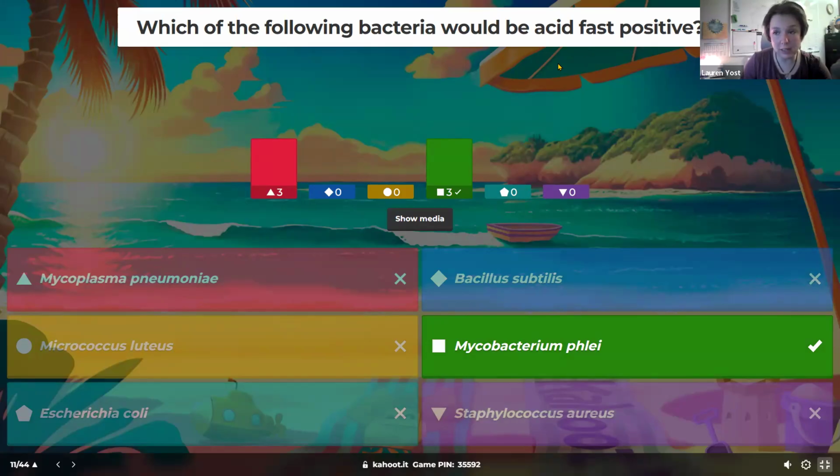If it's acid-fast positive, then we already know from our little cheat sheet notes that it would be pink, that fuchsia color. And why is it staining with our primary stain that makes it fuchsia? Because it holds fast, because the wax absorbs our lipid-soluble primary stain and holds fast even when we rinse it with a hydrochloric acid and alcohol mix, which is our acid alcohol.